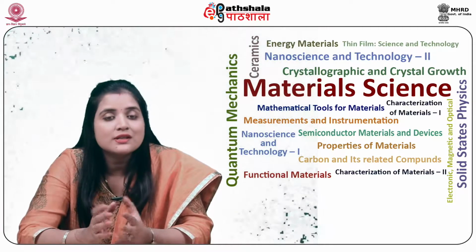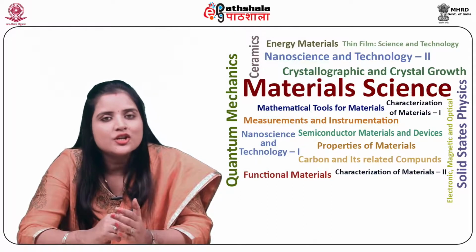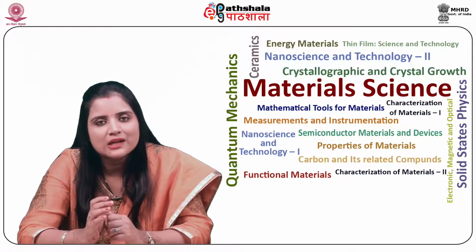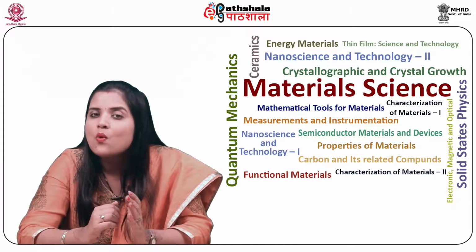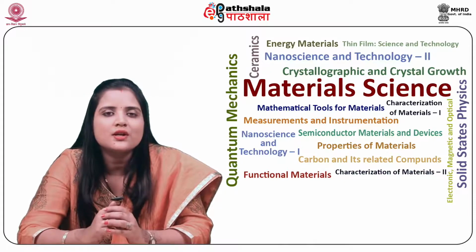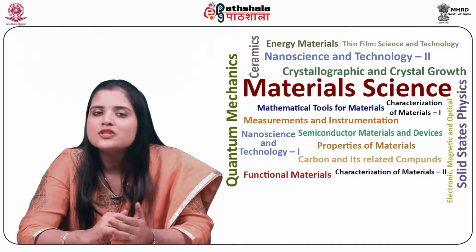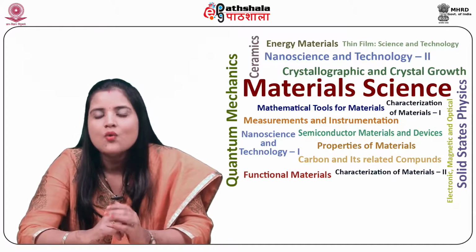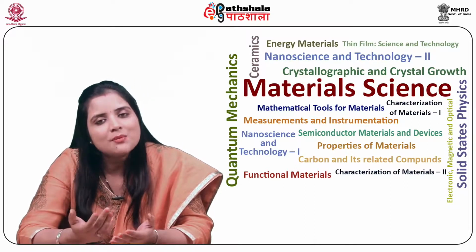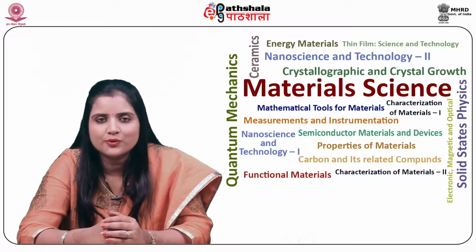Let us now discuss the qualitative analysis. The X-ray generated EDS spectrum helps to carry out qualitative analysis to identify whatever elements are present in the sample when it is irradiated with a high energy beam of electrons. There are three methods of examination. First one is the point analysis. That is, the spectrum is obtained from a point which is radiated with the electron probe.